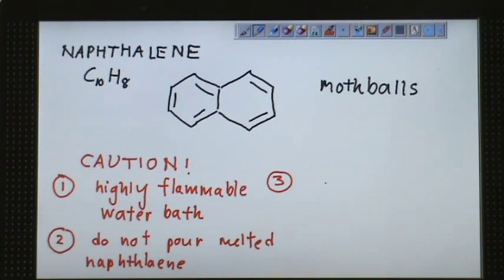Number three, when you handle naphthalene, use a spatula. Avoid skin contact because it's quite dangerous. The proper spelling should be N-A-P-H-T-H-A-L-E-N-E.